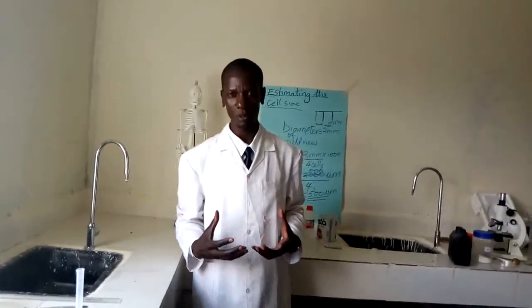I'm your teacher Ibrahim. This is lesson number 10, the practical lesson, whereby I'm going to talk about the test for non-reducing sugars. Non-reducing sugars is a type of carbohydrate which is referred to as a disaccharide, and it is present in foods such as sugar. It is also present in honey. They are characterized by a sweet taste. Hence, when they dissolve in water, they provide a sweet tasting solution.